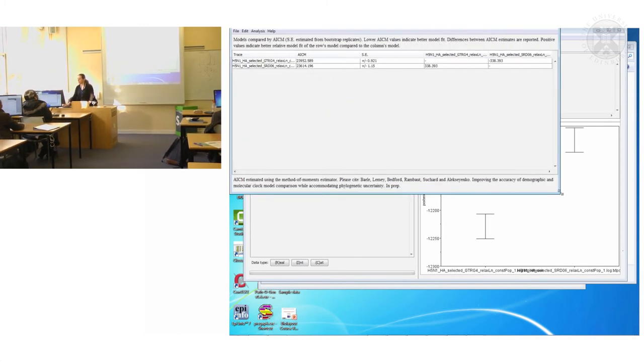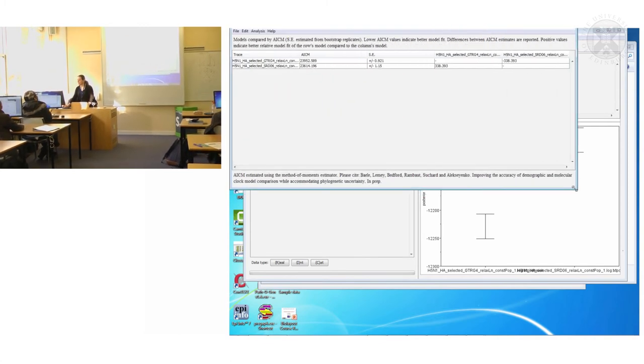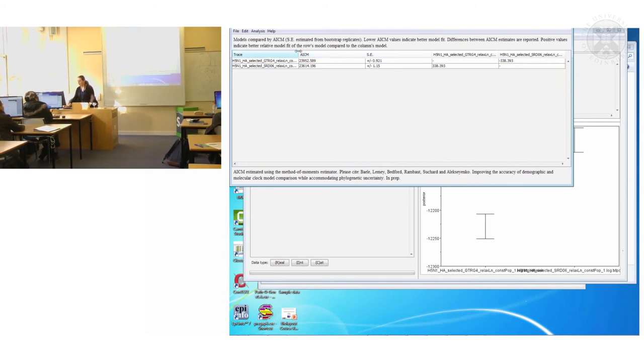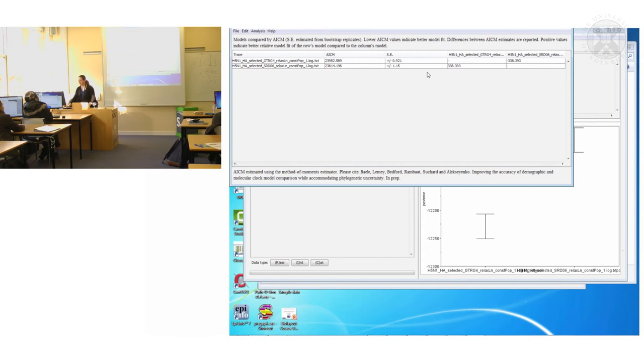So what it has done I hope is it's compared the GTR model with the SRD06 model. In fact the SRD06 model is quite a lot better than the GTR model because this compared to this is positive.